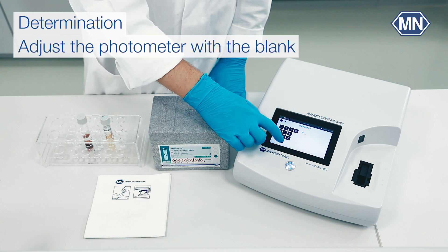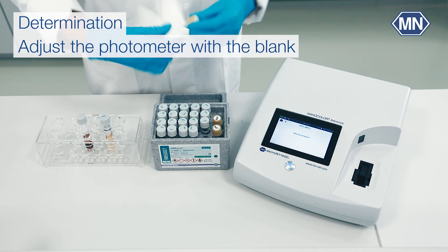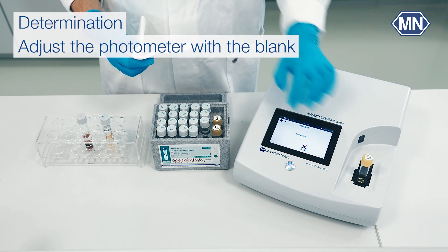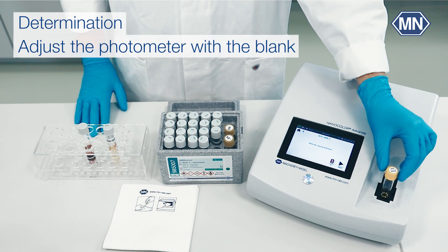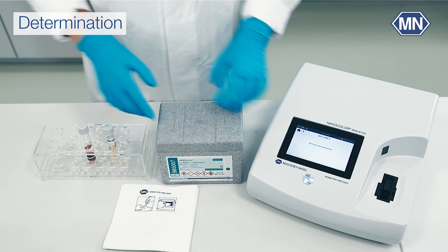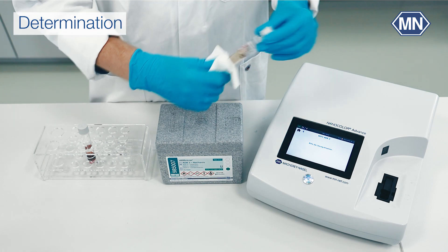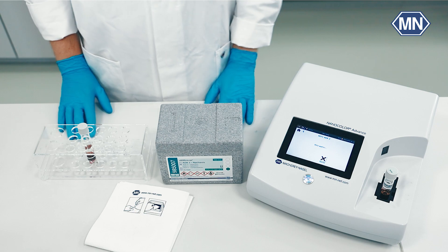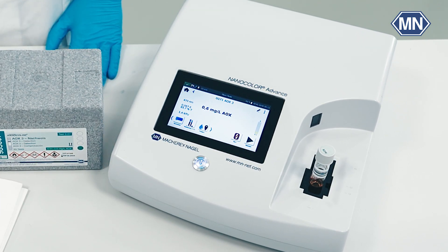Adjust the photometer to zero by using the blank included in the detection box. Insert the AOX tube into the photometer and start the measurement. The result is shown as AOX concentration in mg per liter.